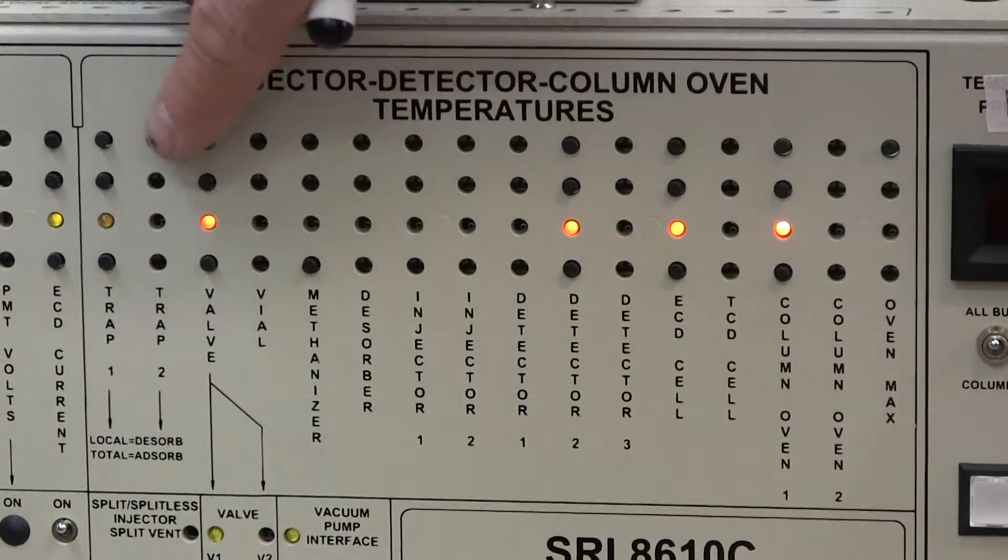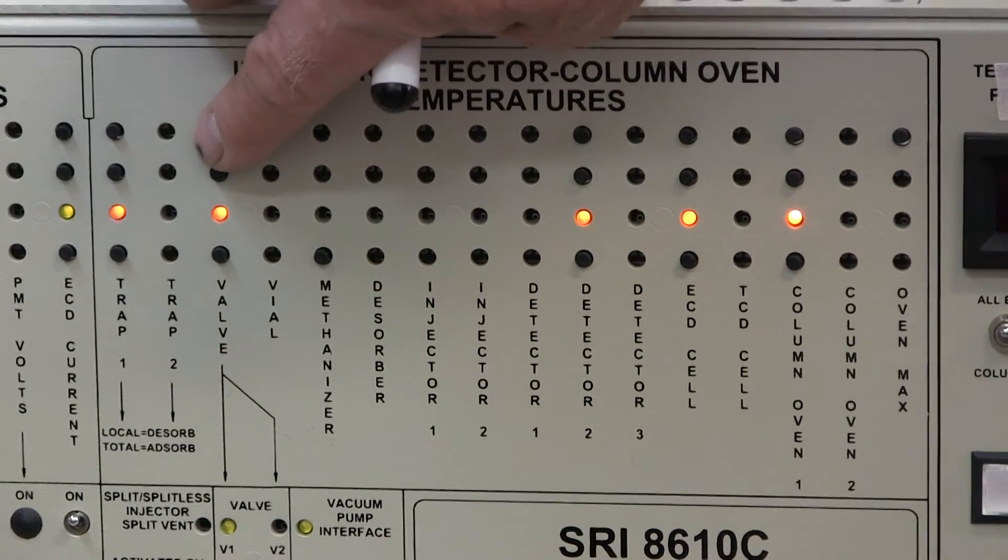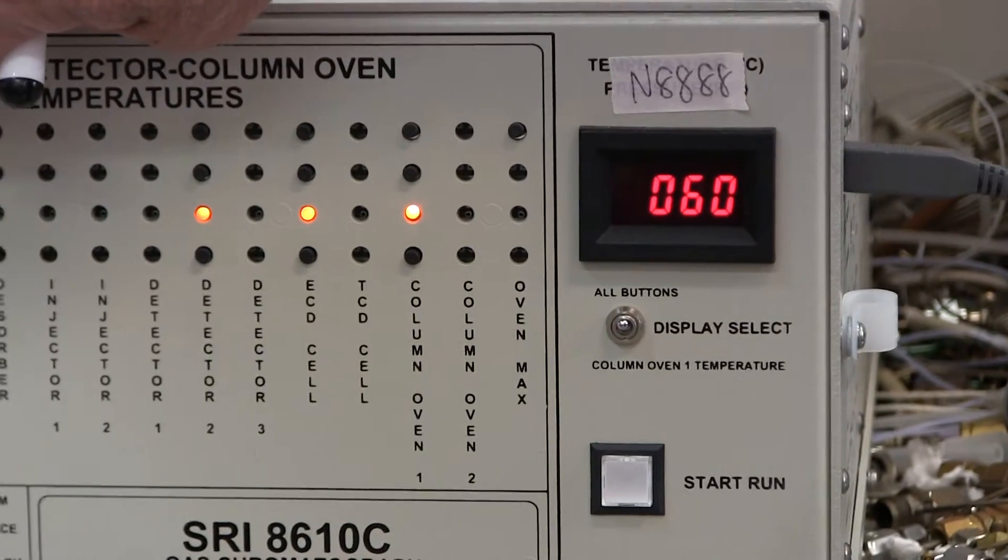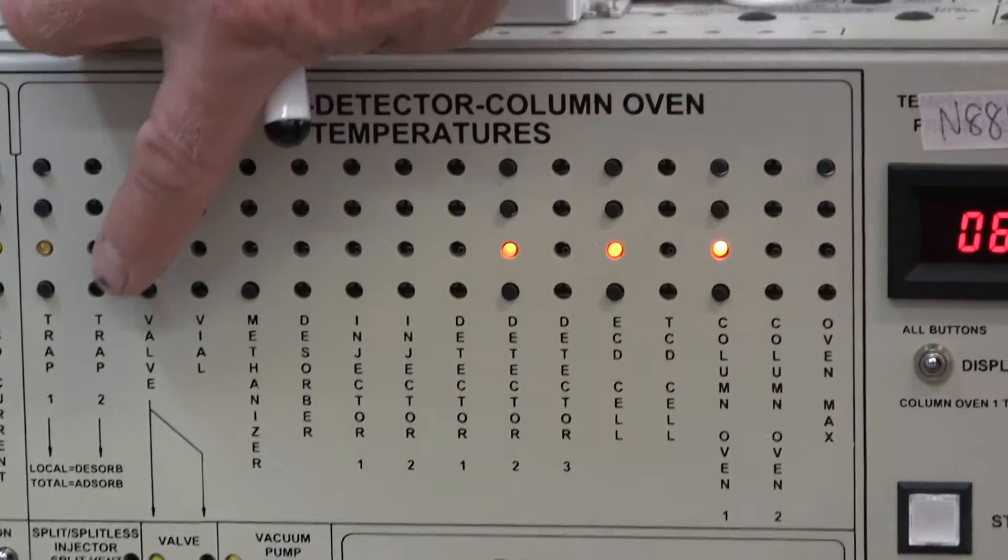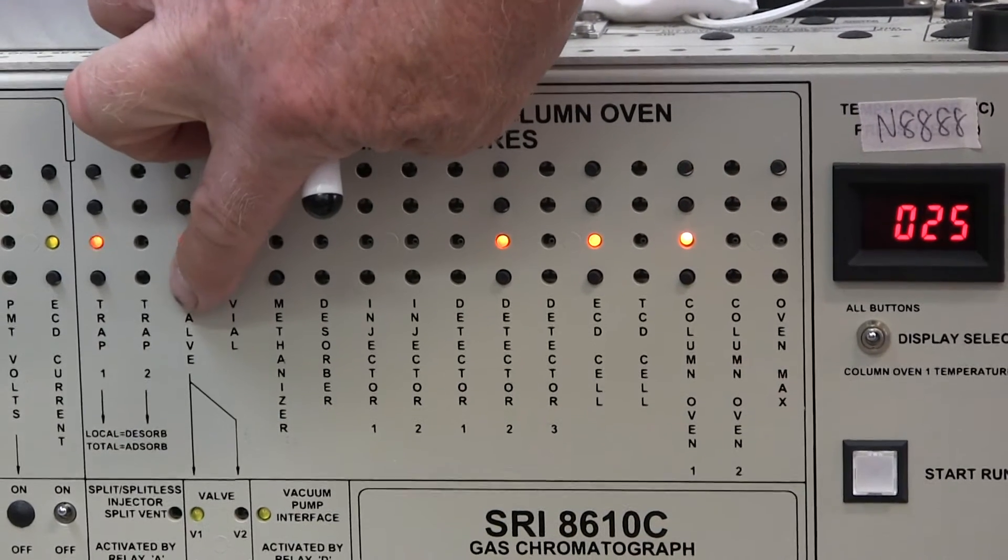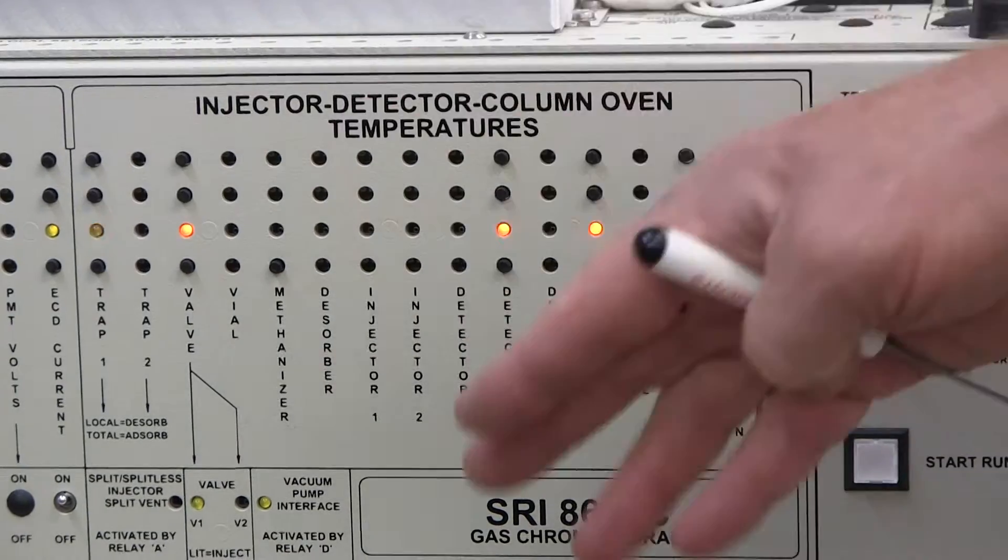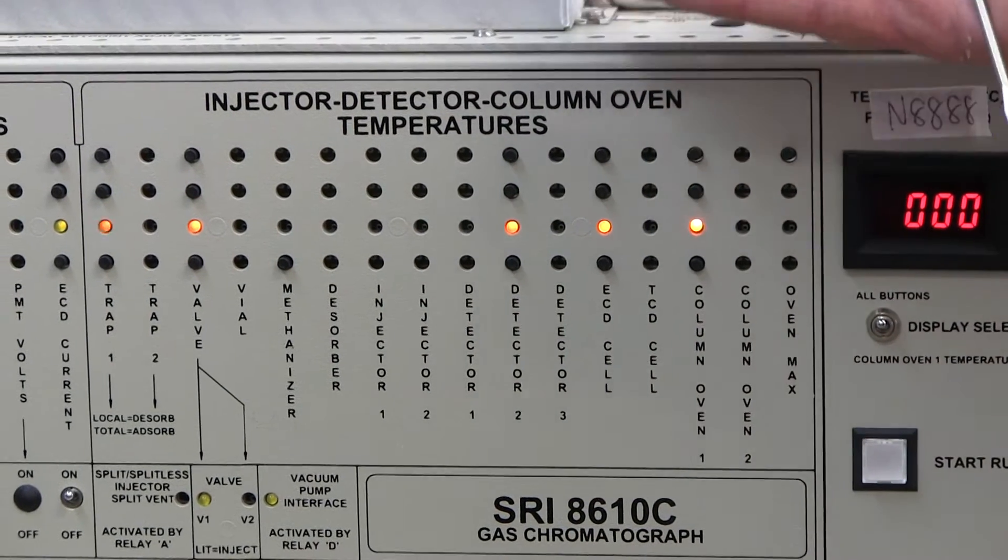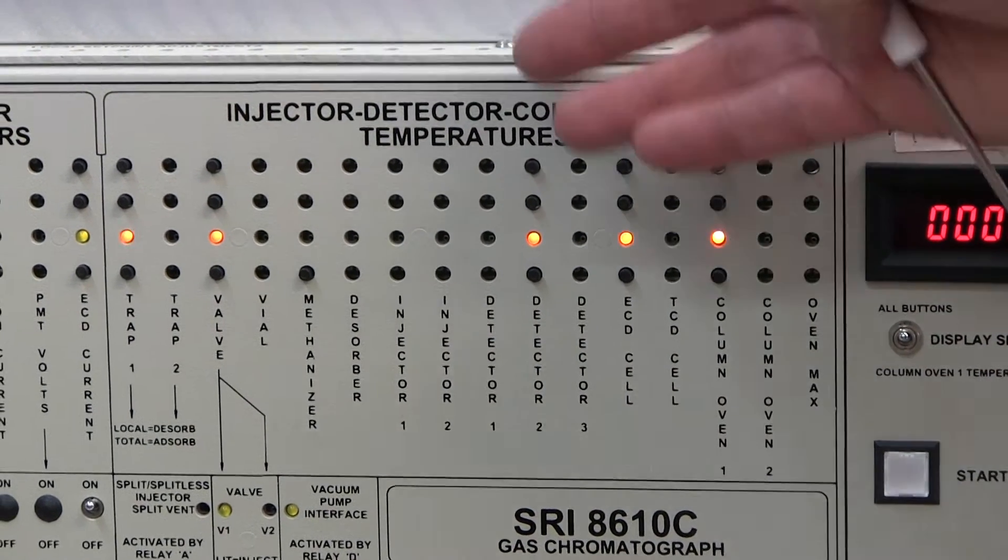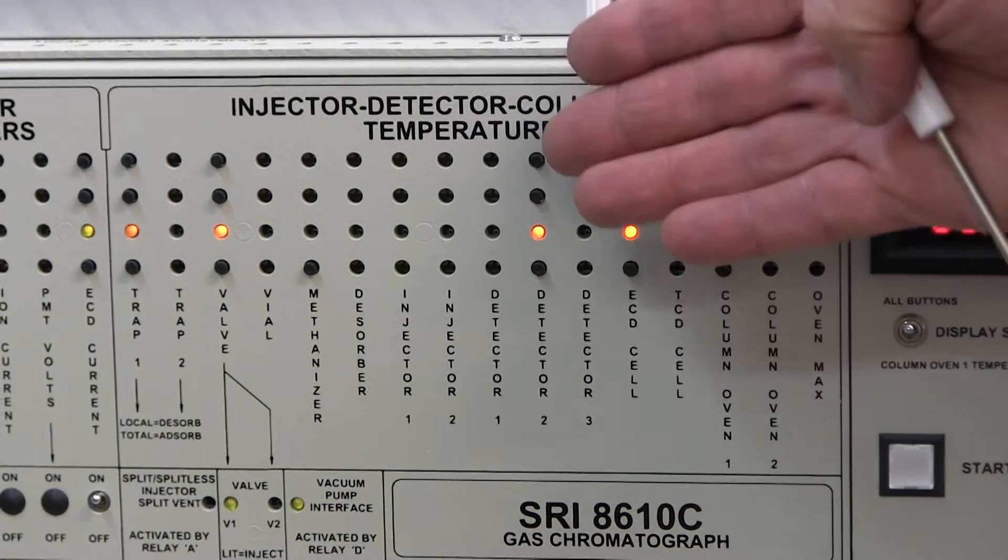For instance, the valve temperature. If I push the top button, it tells me what the set point is, in this case 60 degrees centigrade. If I push the bottom button, it shows me what the actual is, in this case 25 degrees centigrade. So it's in the process of heating up. It's not really at its set point. But that's how you know when things are working correctly.